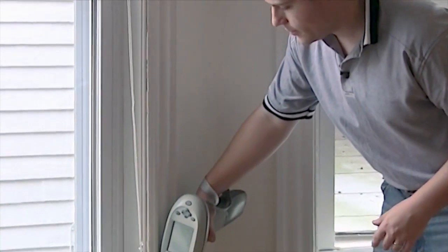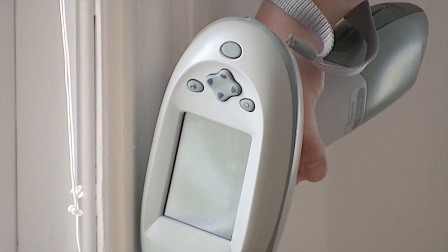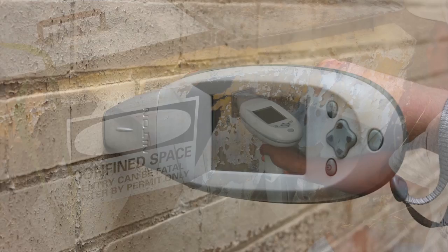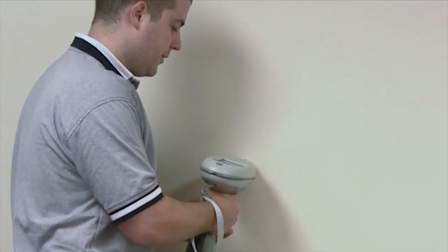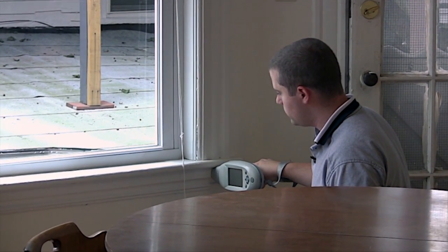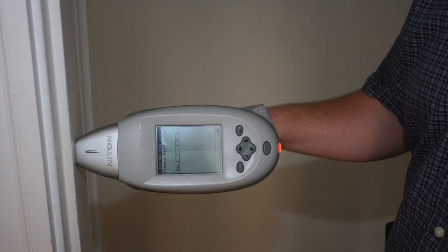Our ThermoScientific portable XRF analyzer is the ideal tool for lead paint inspection. Our ThermoScientific Niton XLP300 analyzer is designed to meet the rigorous demands of lead paint testing and is supported by a Performance Characteristics Sheet which documents how the U.S. Department of Housing and Urban Development, or HUD, has determined our instruments are part of an acceptable methodology for conducting lead-based paint inspection.